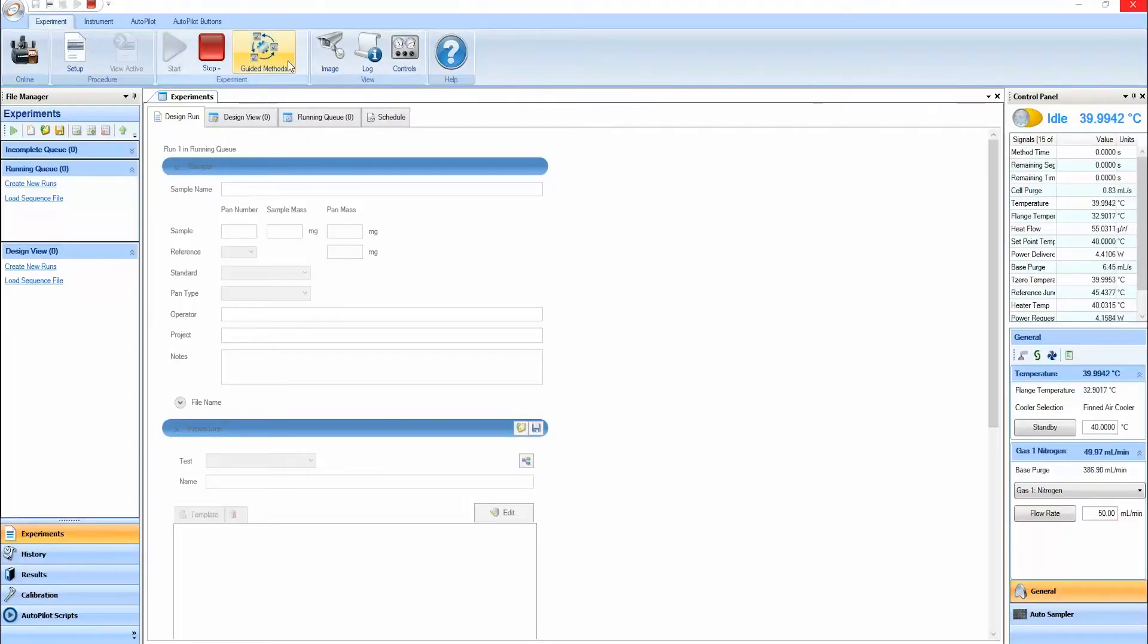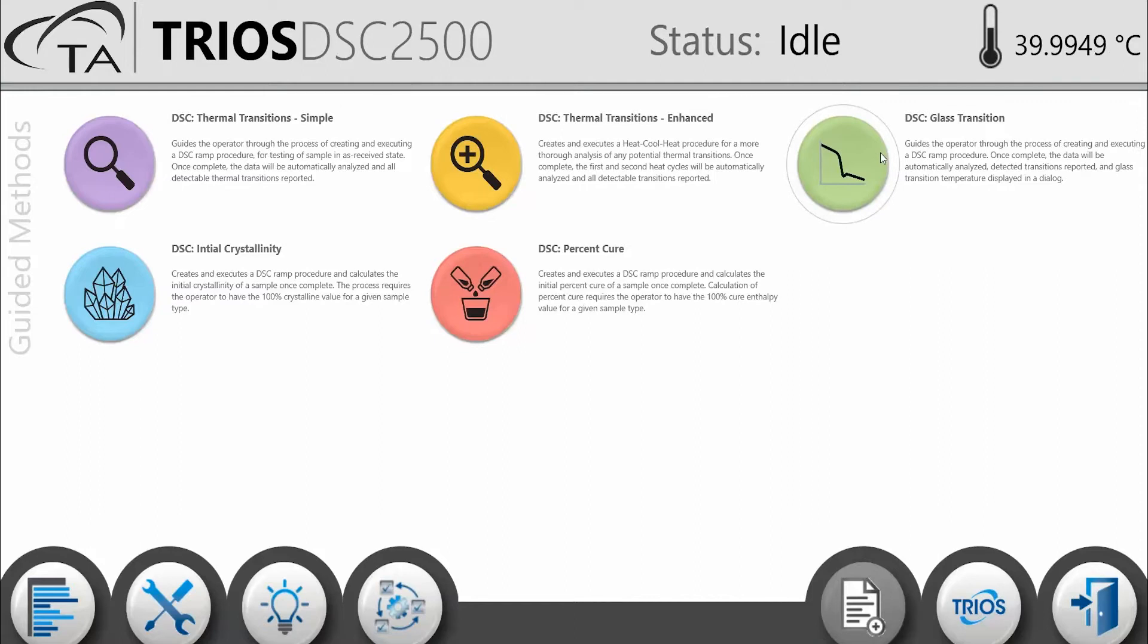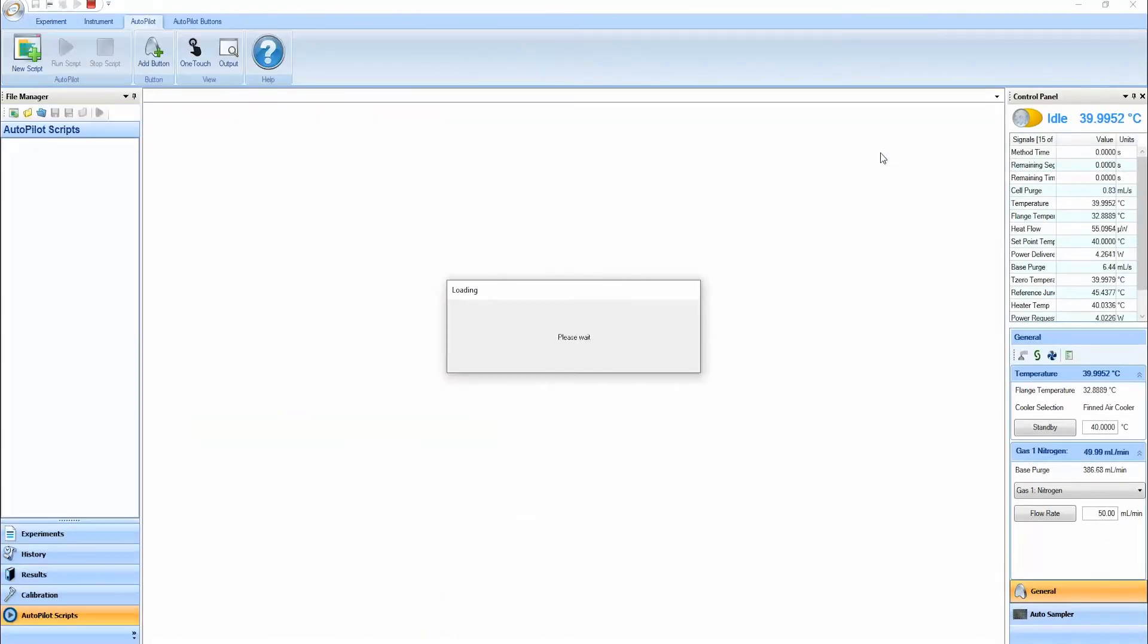In this Tech Tip, we will walk through the features of the DSC Glass Transition Guided Method, a quick way to create a method to determine the TG of a sample.